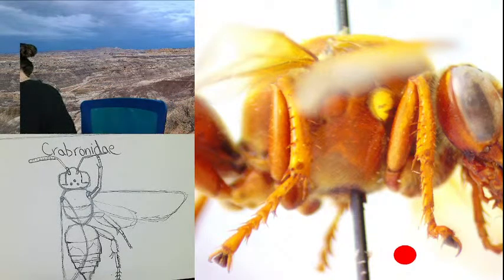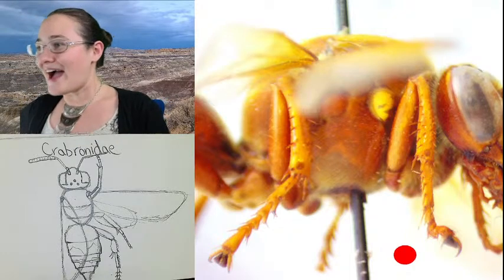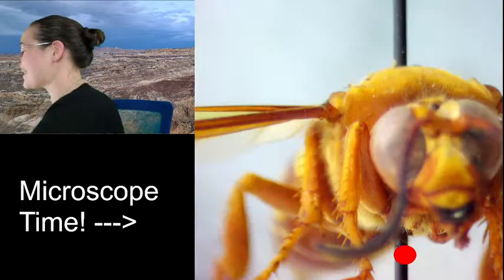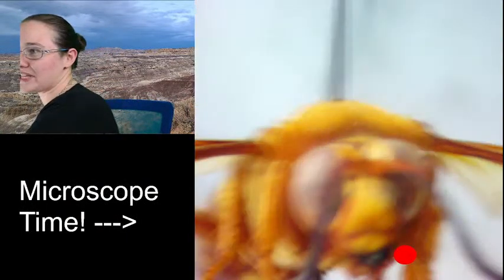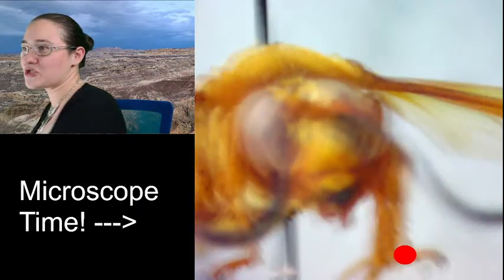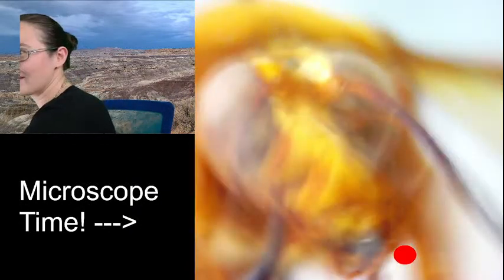All right. If we wanted, we could look at the mouth. We could look at this cicada killer head on because I think that this is a view that's always really sweet, really awesome to check out. I like to see the cool mouth parts and the antenna. Plus, this way we can see the labial palps, the mouth fingers, my favorite thing ever. Look at those.